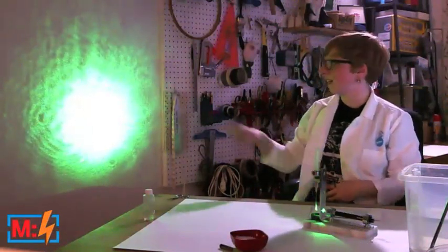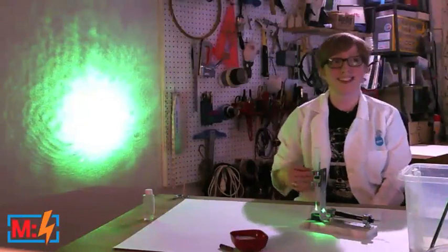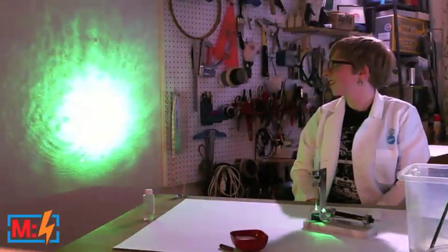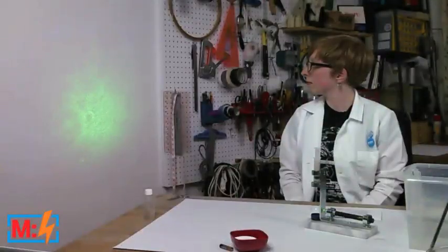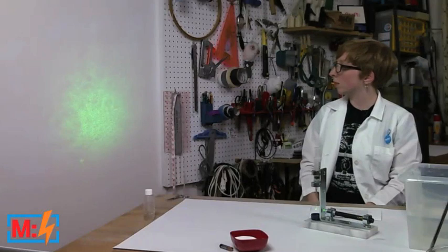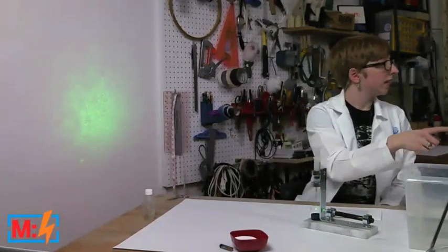Hopefully you can see we have — Sean, what can you explain to us about what we're seeing here on the wall? Well, I can't actually see it right now, but what you're seeing is a bunch of little dark spherical objects moving around — typically they have rings of refraction around them. After you watch for a while, you can sort of get a sense for the way the particles are moving. When you see something that's living, you will know it because it's moving independently or swimming or wiggling apart from the random fluid motion. When I turn the ceiling fan off — we try to get as little air current as possible — it really swirls when the ceiling fan's on. You have to leave it still for a while to get a good image.